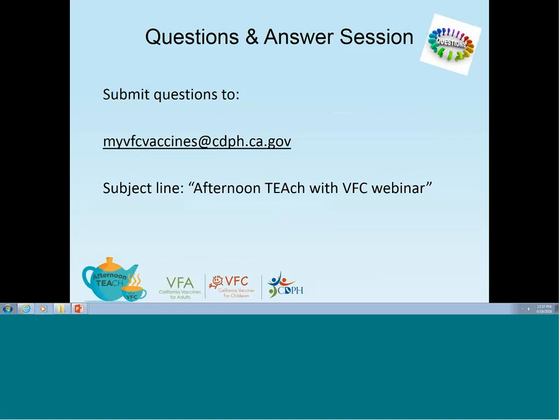So I think we're just saying that's a very strong consideration for you when you're looking at maybe recalibrating your devices, and a consideration as to why this is happening. You do want to capture that information when it happens, and if you see it, we recommend you work with that vendor and manufacturer to try and get a true explanation of what is happening, because there is no way for you or for us to determine whether it's truly a static suppression issue or whether your refrigerator did go down or go up to those temperatures.